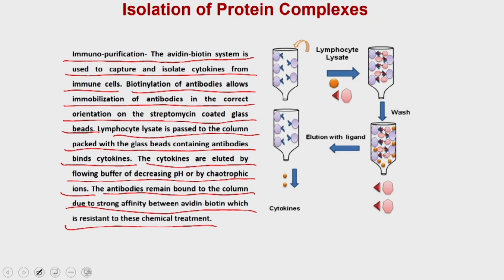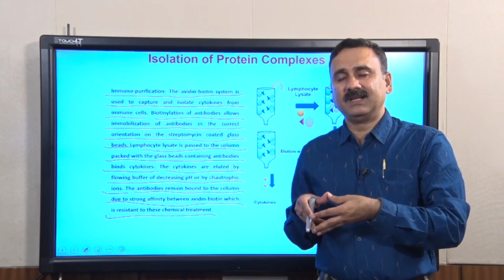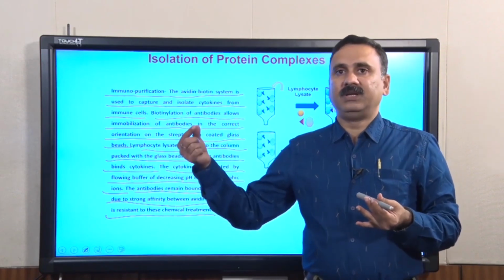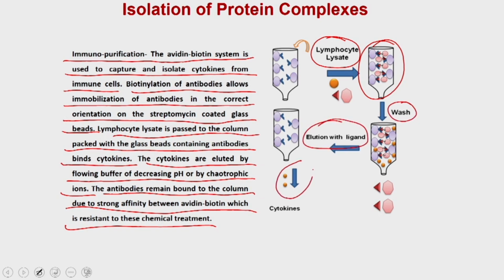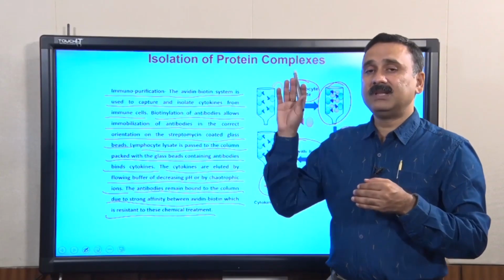So, apart from isolating the cells, you can also study the cytokine profiling from these cells. Every cytokine is going to have its antibody, so you can use that antibody coupled to the avidin and biotin system. Avidin has a very strong affinity for biotin, and you can take the lymphocyte lysate and pass it through the column which contains this particular kind of antibody, then you wash and elute with the ligand. When you do the elution, only those cytokines will come which have affinity for the antibodies present on these beads, and that is how you are able to identify the cytokines which are being secreted from these lymphocytes.